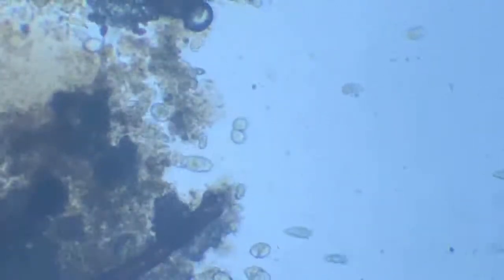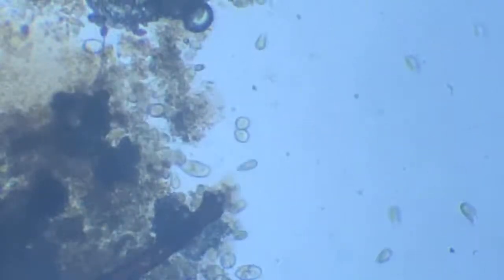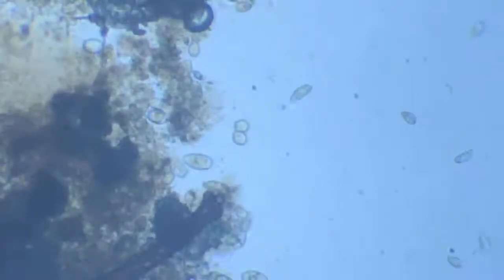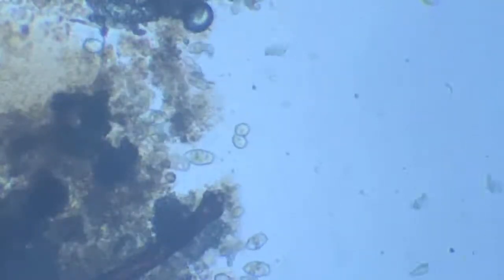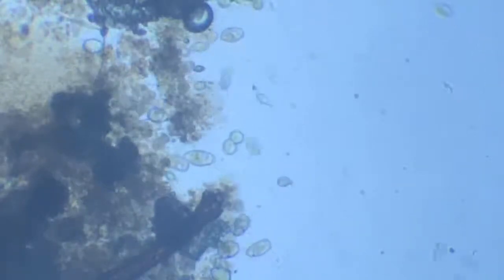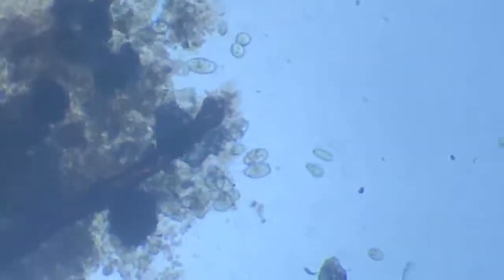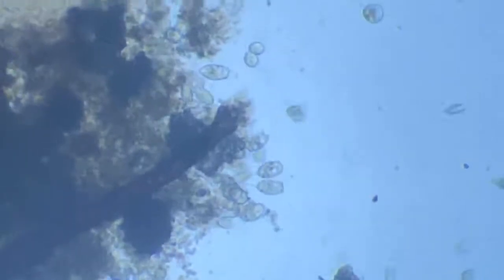Remember, we are at the lowest magnification of the microscope. The objective is 4x and the eyepiece is 10x. So we are presently at 40 times magnification. Of course, the cell phone camera has also magnified it, say, twice. So we are probably at 80 times magnification, and we see these colonies of vorticella. Then there are a lot of ciliates around. Blepharisma could be.